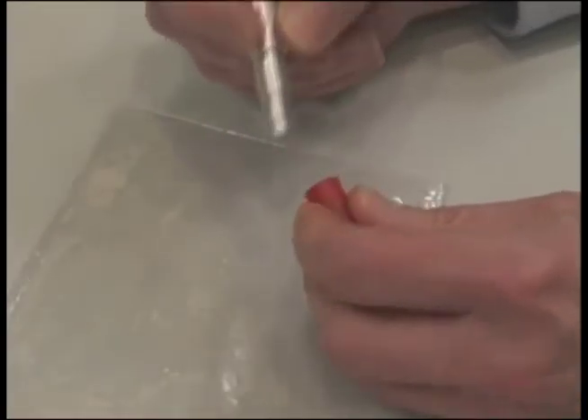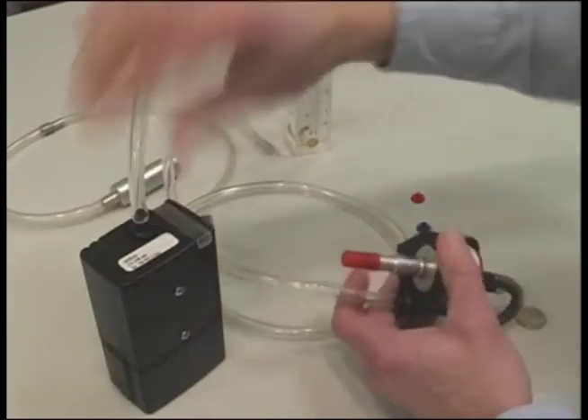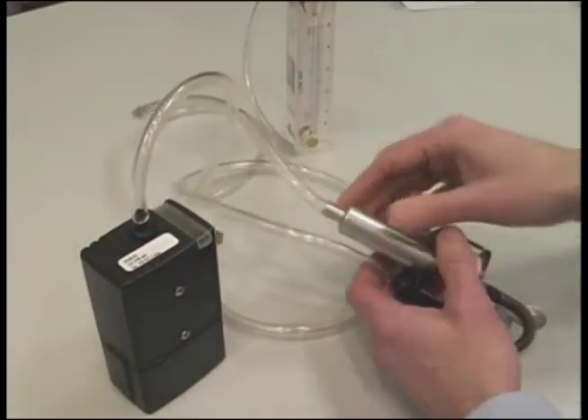Discard the material in the cyclone and grit pot, and once back in a controlled environment, reassemble the filter cyclone and chamber to perform post-calibration.